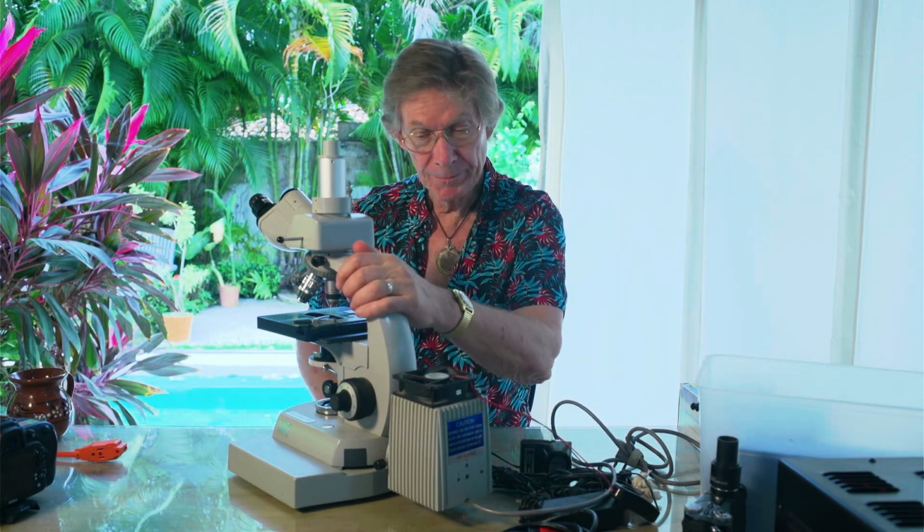And at that time, it cost $175,000, which translated into today's money is well over $1 million. The Zeiss company, same company that made this one, made 800 of these very special, extremely expensive microscopes at that time. It was a project that unfortunately was scrapped because they were simply too expensive and they didn't sell that well because they cost so much money.